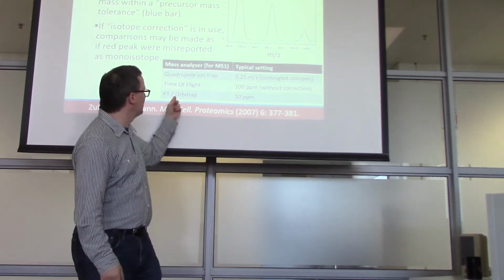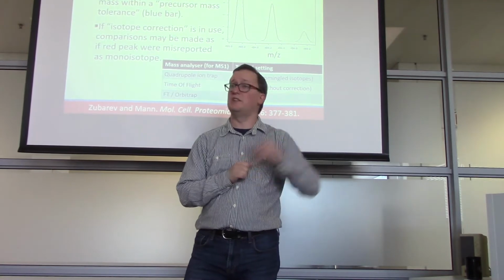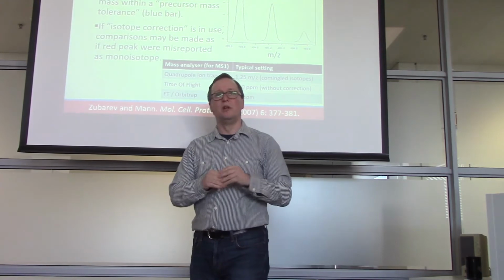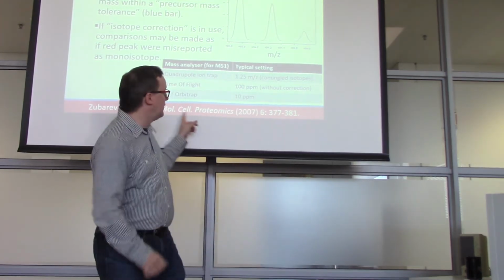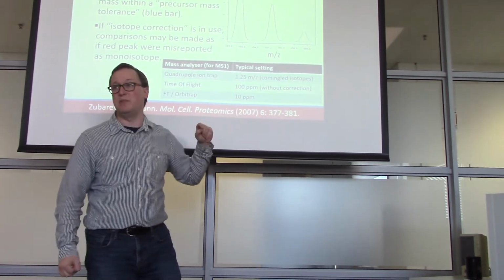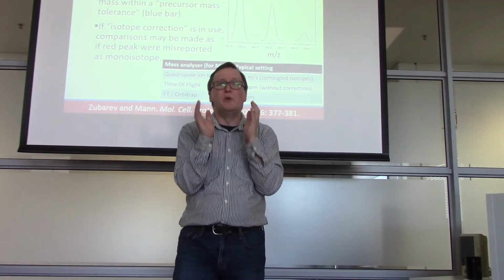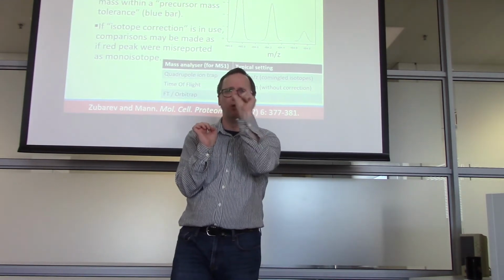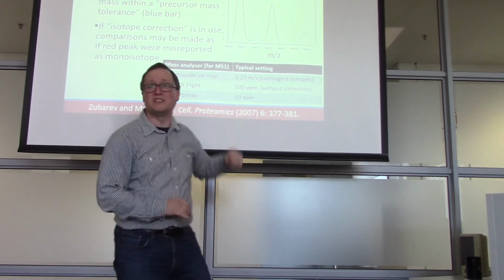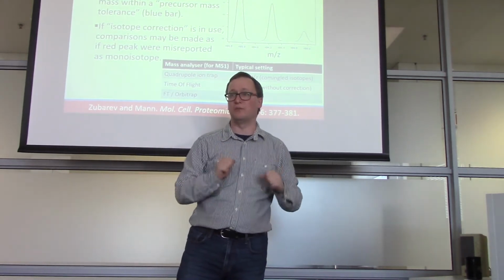Now maybe you're using one of the newfangled Orbitrap or FT class instruments. So we have some of these over at places like CPGR, and of course at our campus and over at UCT. So Orbitraps are pretty easily found in this country. That means that you may know the mass of the precursor ion within 10 ppm. That's a vanishingly small window, maybe within 0.002 m over z. It's a tiny, tiny window of accuracy. So the accuracy of the instrument is then going to affect how many candidate sequences must be compared to each spectrum.